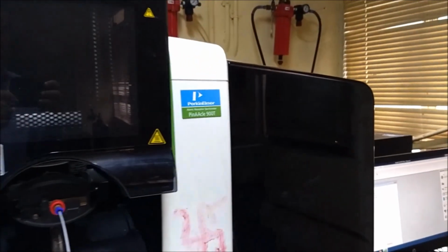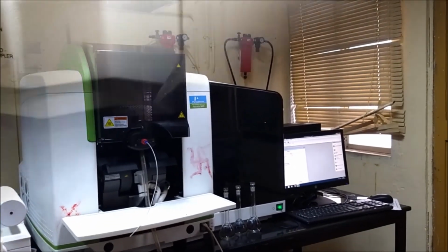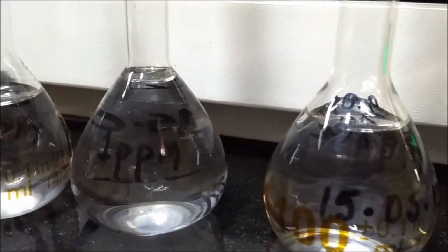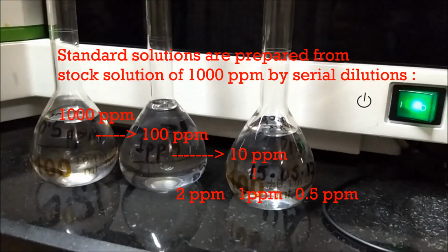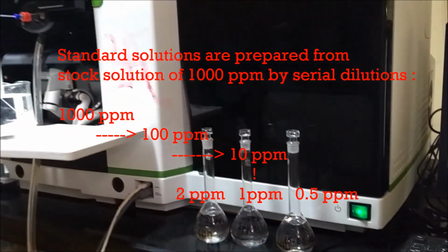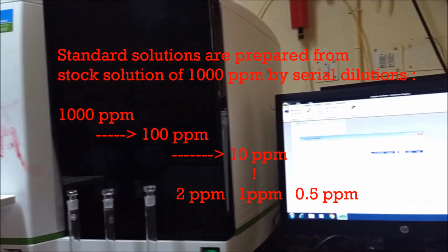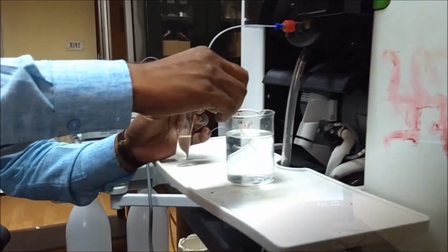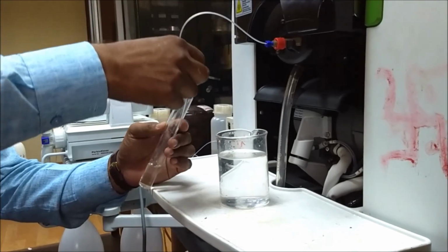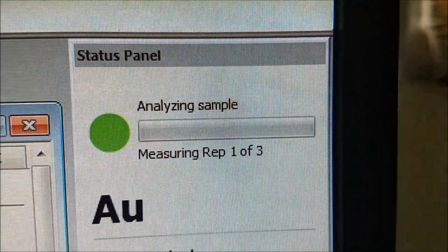This is the flame AAS instrument. We will measure gold by aspirating the prepared solutions. But before aspiration, we will prepare standards for calibration. The standards are prepared by successive dilution from 1000 ppm stock solution as shown on the screen. As you can see, the samples are aspirated in this manner and gold is determined at 242.8 nanometers.